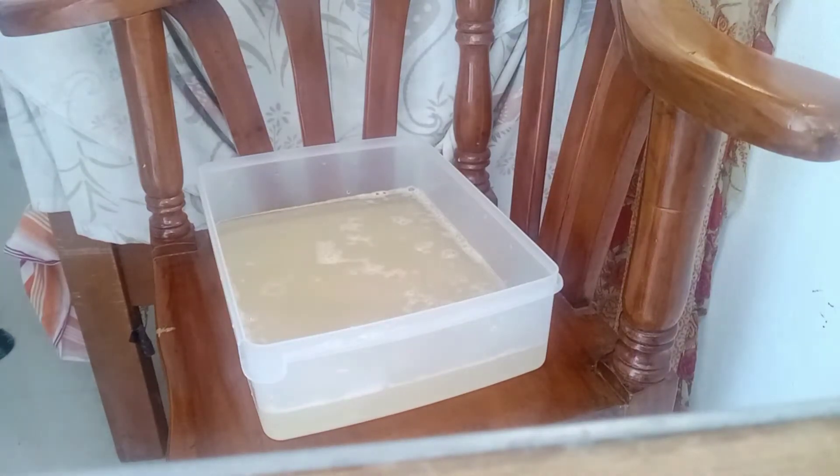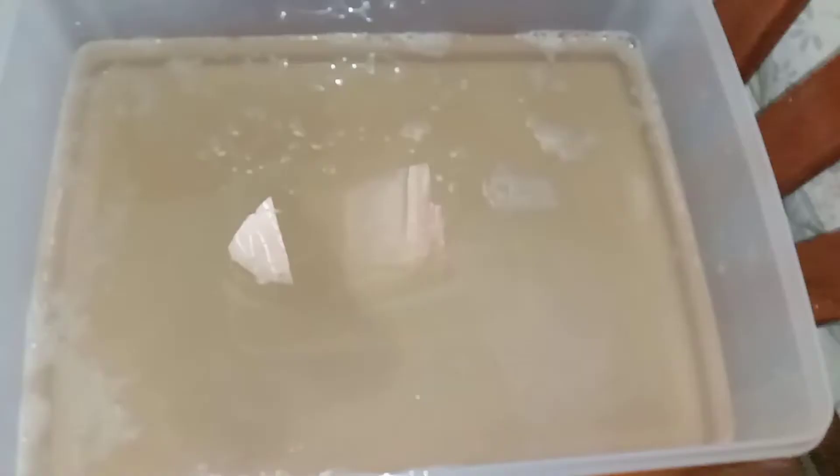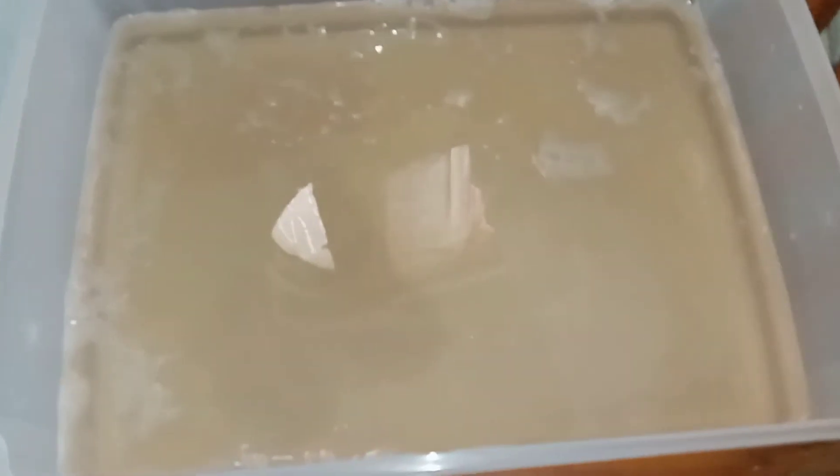We will now let this mixture sit for hours for the starch and water to separate. After a few hours, the white solid color that you can see at the bottom of the container is the starch that we will be collecting. The next step is we are going to remove the top water.